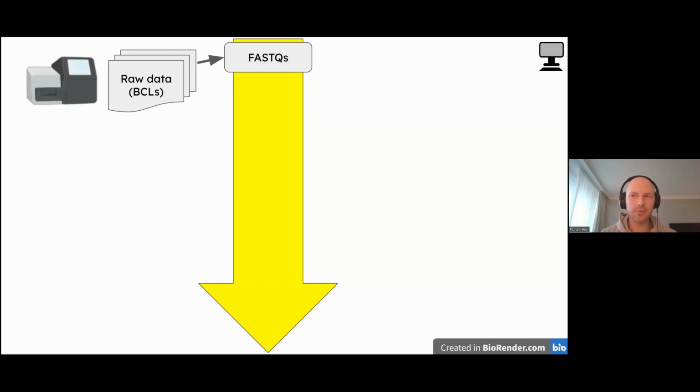However, if you have, for example, 10x Genomics, then you can use CellRanger. They have a module called mkfastq, I think, and this module then creates from the base call files, so your raw data, your FASTQs. I don't know for SmartSeq how you would do it now, but for 10x you can use CellRanger. From there, if you have the FASTQs, and I now assume that everybody knows what that is, so it's basically your read file.